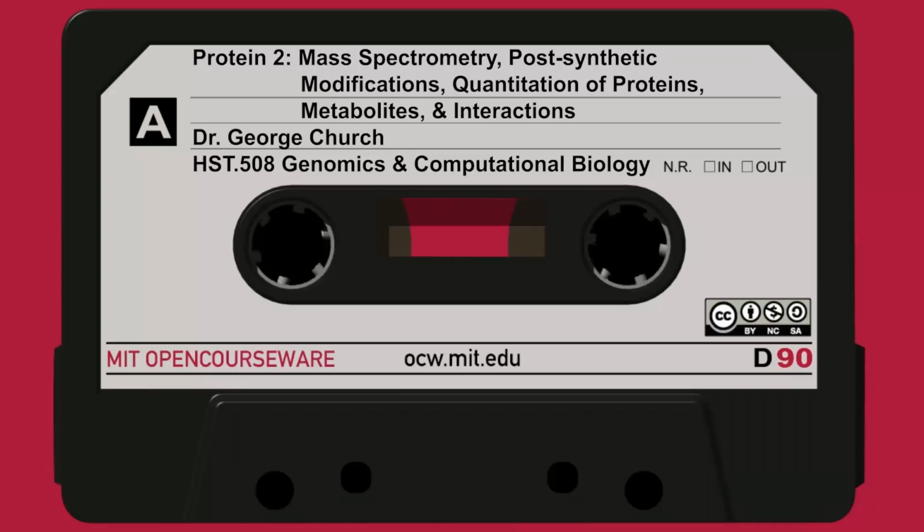So this is the first category. This is de novo sequencing, and it takes on all the challenges in the previous slide. It takes on the possibility of missing data for particular ion species that you think should be there, but for some reason are not efficiently cleaved by the argon in the collision-induced dissociation. And it takes into account that you have to have one set of B ions, a nested set of masses from the N-terminus, that have to be complementary to the nested set you get coming in from the C-terminus. So this is dynamic programming, and you can probably count how many different times we've done a dynamic programming algorithm in this class. And so hopefully you're happy that you did at least one of them by hand.